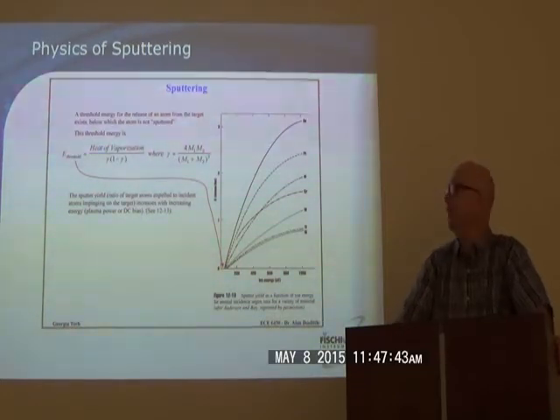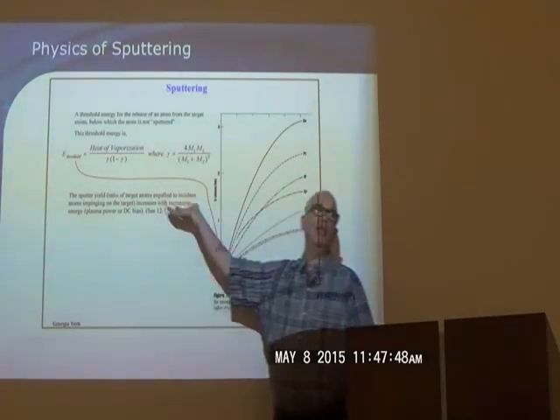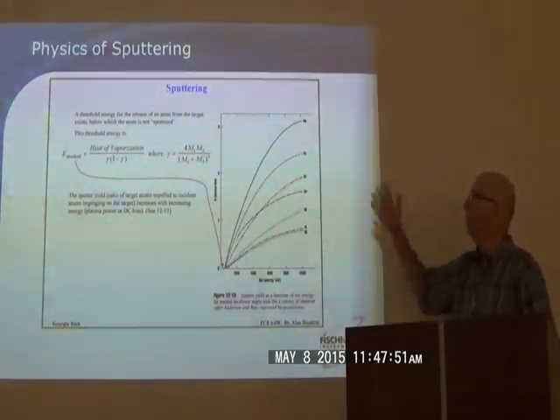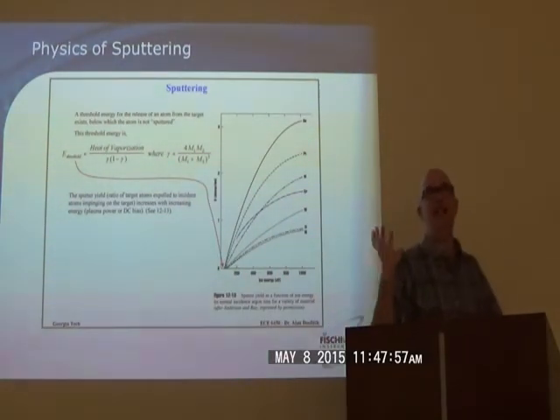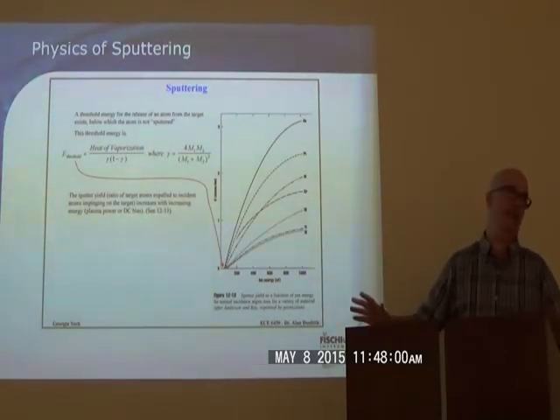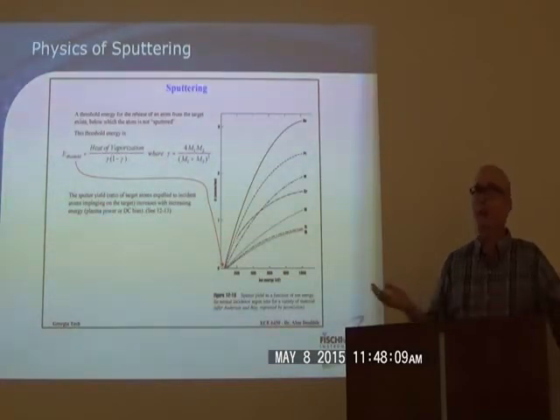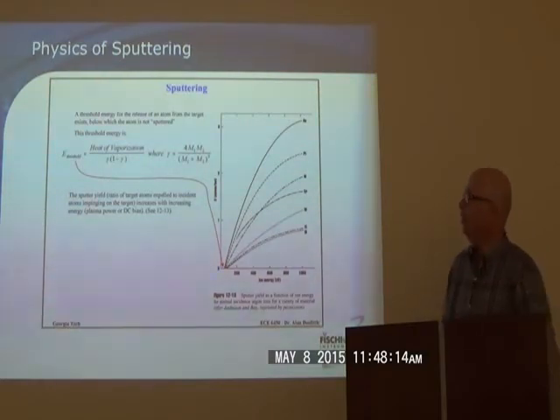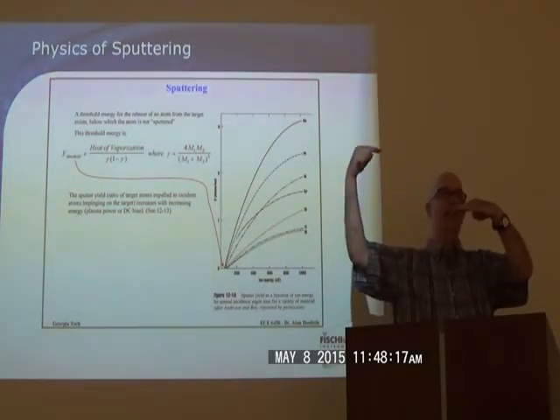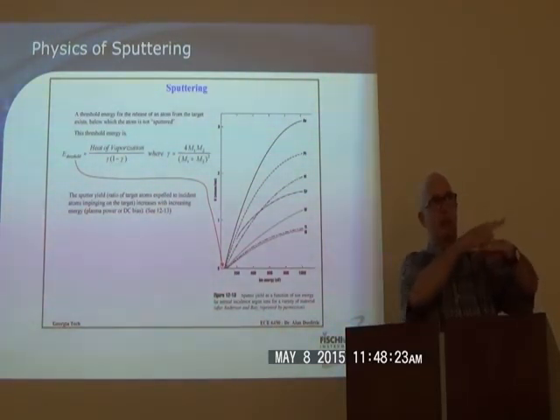So yeah, this is of course kind of the Newtonian model. That's what I wasn't going to point out, but if you think about this, it's okay actually to use bowling balls as an analogy, because this is assuming basic physics. And that's why I always point out, and that's why the amorphous layer really forms like it does, quantum mechanics means you can't always determine where something is and what it's doing at the same time. So on a solid, it's not really a billiard ball coming in or a bowling ball coming in and either another billiard ball or a pin going out.